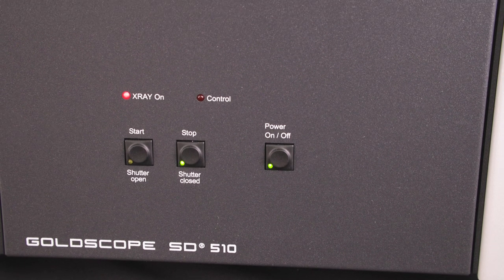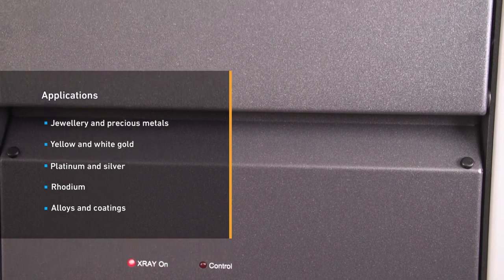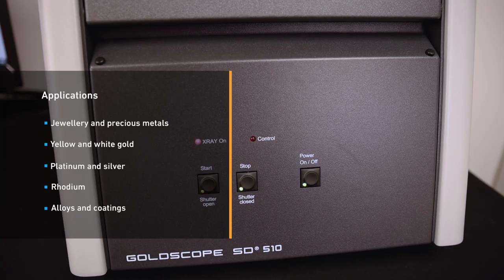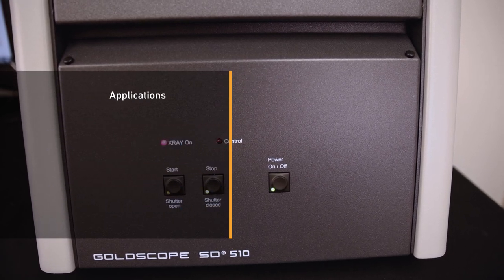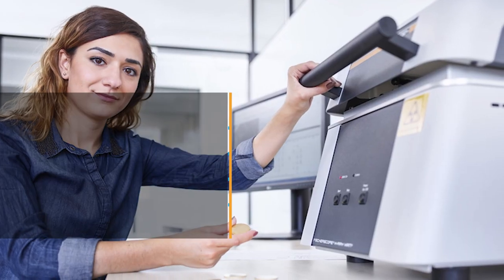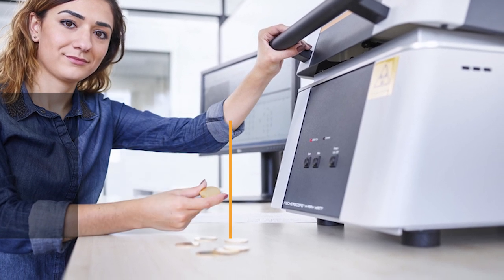The instrument is part of the Fischer GoldScope series. Typical fields of application are jewellery, precious metals and dental alloys, yellow and white gold, platinum and silver, rhodium, alloys and coatings. The instrument is aligned to specific industry requirements, which means it can be used immediately with minimal operator training.